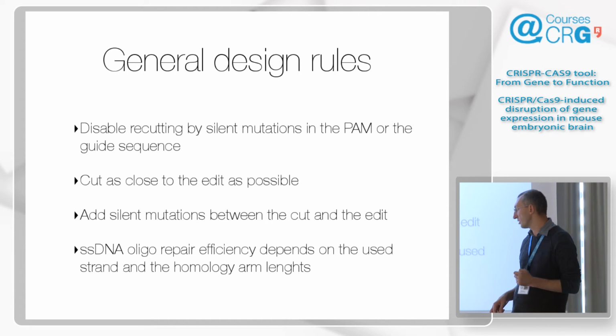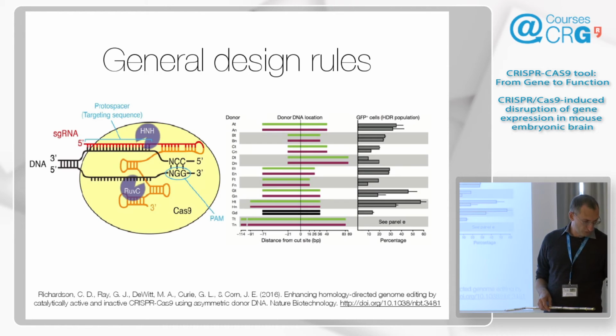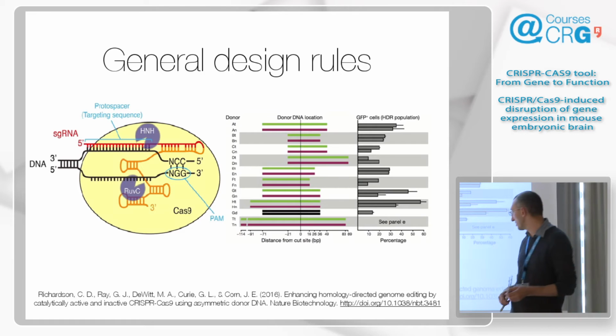Which one do you use? And then it also depends on the length of the homology. There have been multiple papers exploring this issue, but I would recommend you read this one if you haven't, because we found that this influenced our results quite a bit.